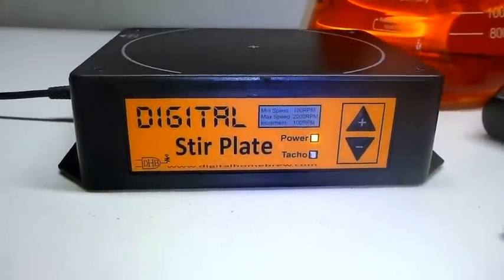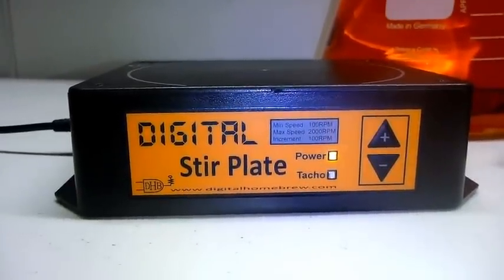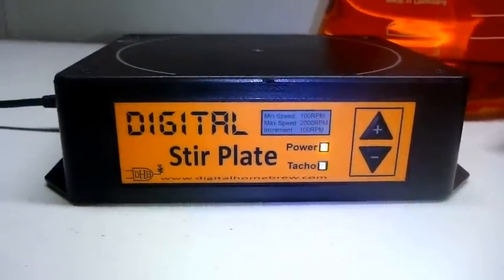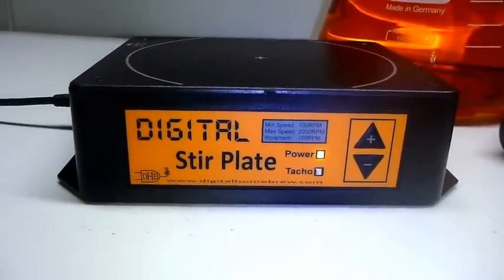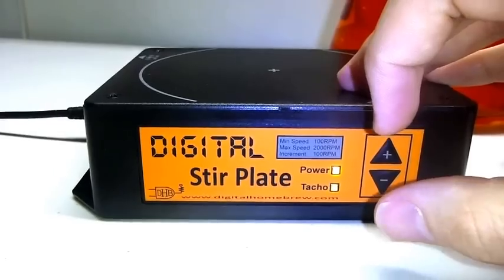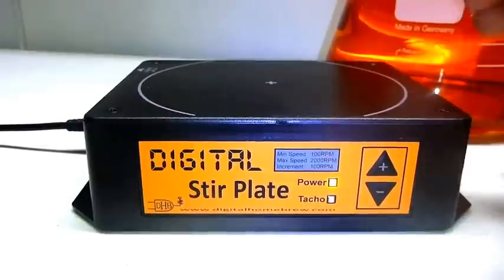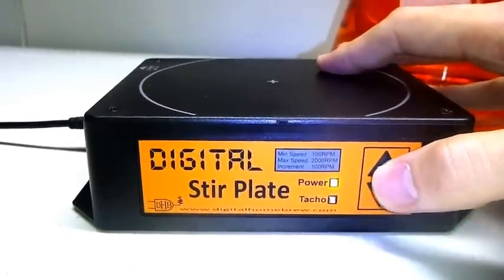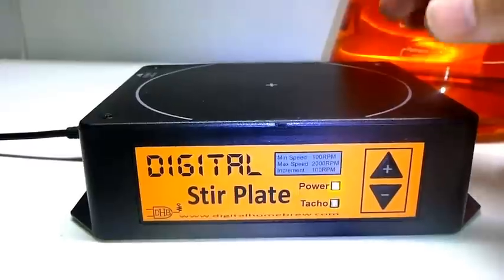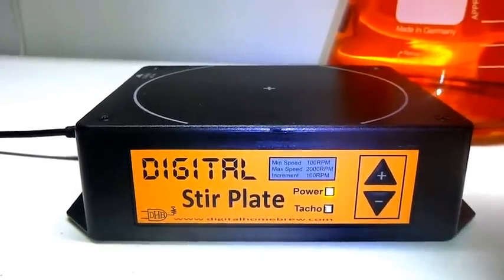For those that don't know, the digital stir plate is a magnetic stirrer designed for brewers when they're making starters to stir their starter wort. That differs from a standard run-of-the-mill analog stir plate — an analog stir plate will usually have a dial to set the speed to a rough amount, whereas the digital stir plate uses up and down buttons to set the speed in increments of 100 RPM. That's controlled with a microcontroller inside, sort of like the cruise control on your car, so it'll do all the work to maintain a set speed.